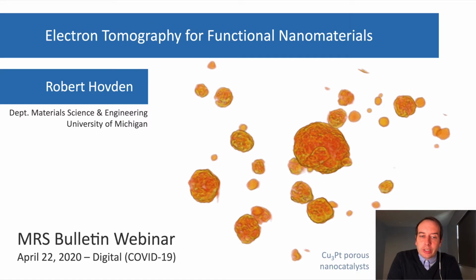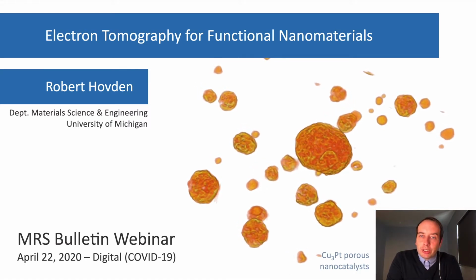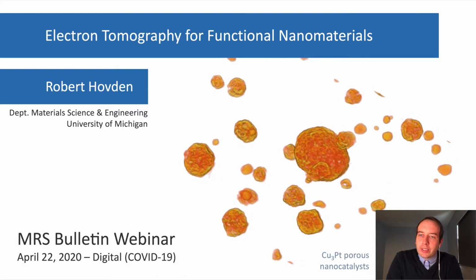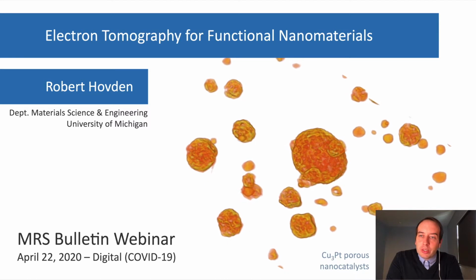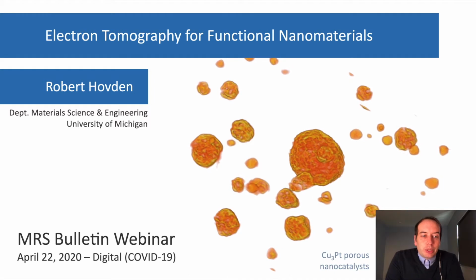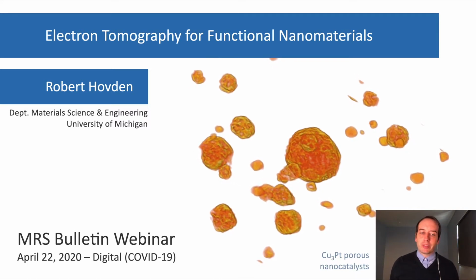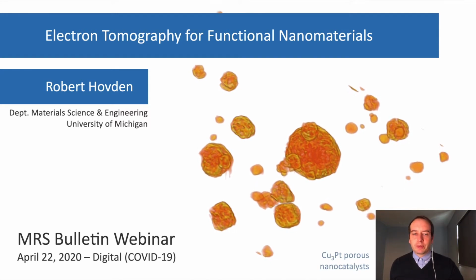For nanoscale characterization, it's been a long-standing goal to observe and quantify three-dimensional structure. Not just surfaces, but the entire internal volume and its chemical arrangement. We've seen over the last 2 decades, electron tomography has progressed substantially, both in resolution and dose, as well as chemical sensitivity. Combined with recent innovations in computational resources, reconstruction algorithms, and 3D visualization tools, scientists are now interactively dissecting volumetric representations of their specimens and extracting meaningful statistics of their three-dimensional structure.